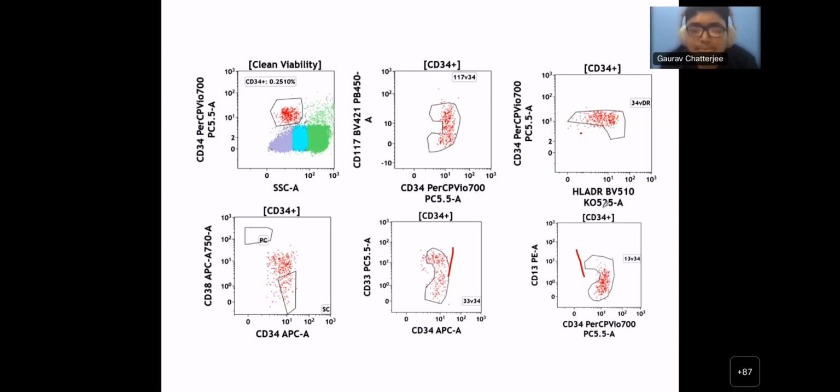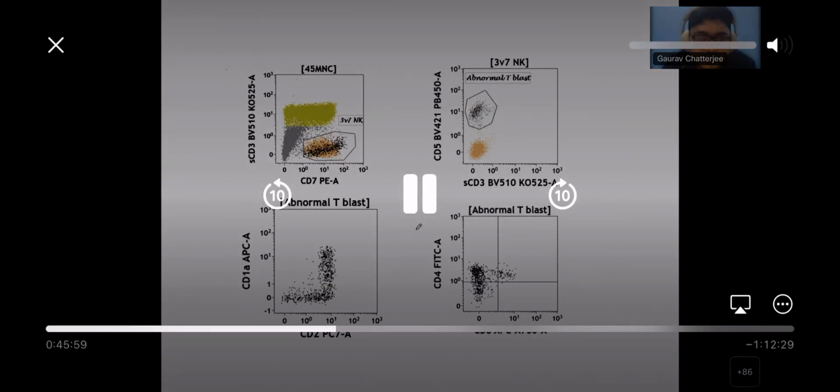Jhansi? They're normal within the gating, sir. Correct. Just tell us what you see, don't overthink. Like you said, everything seems to be within the gate, so this myeloid blast also seems to be normal. I'll also draw your attention to the fact that the percentage was very low in the peripheral blood, only 0.2% myeloid blast, and this seems to be normal. So we saw the B blasts, they were normal. The B cells, they were normal. The myeloid cells are also normal.